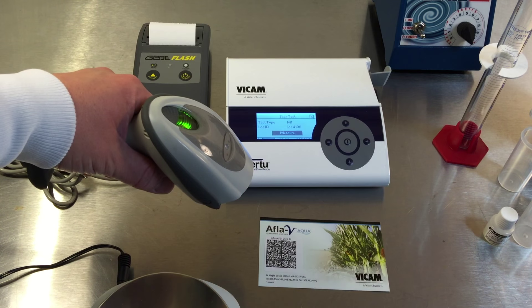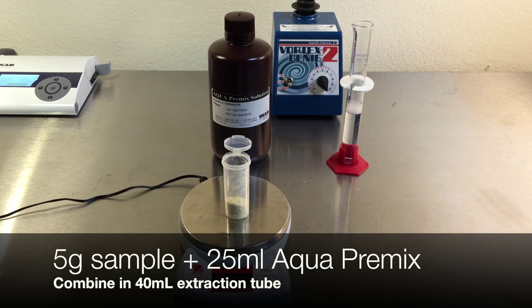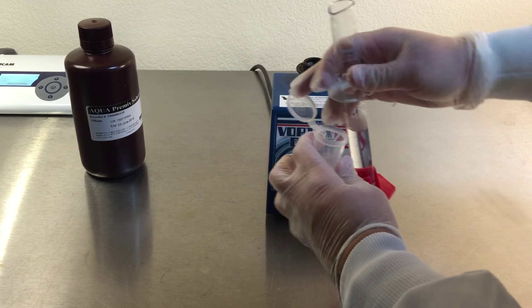Using the barcode scanner, scan the calibration card, unique to every lot of Afla-V Aqua strips. Measure 5 grams of corn sample combined with 25 milliliters of Aqua premix extraction solution in a new 40 milliliter extraction tube.